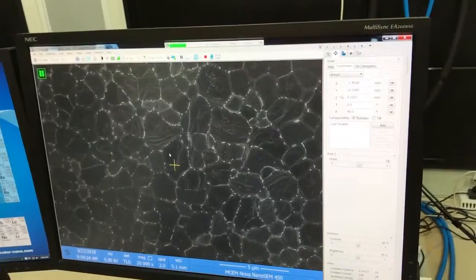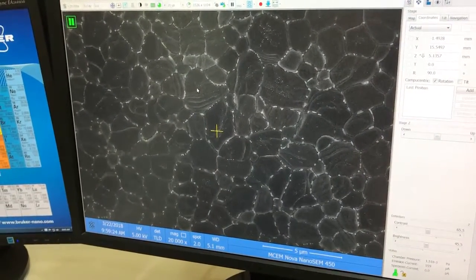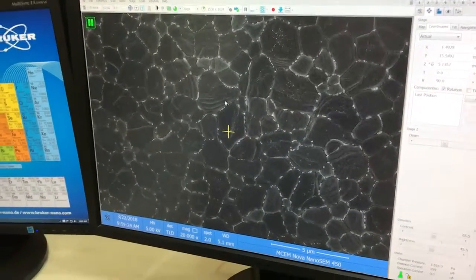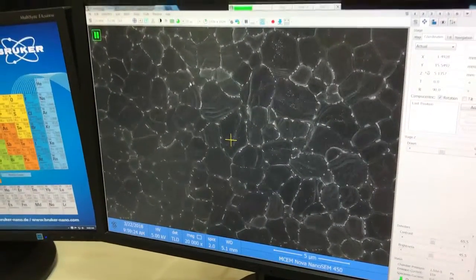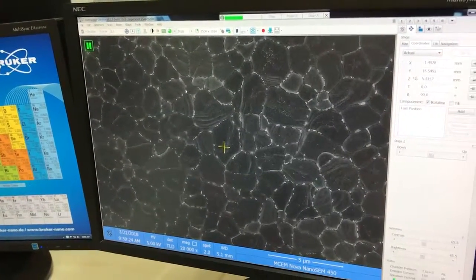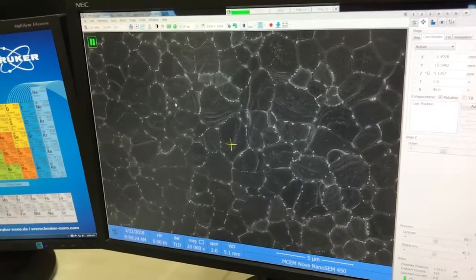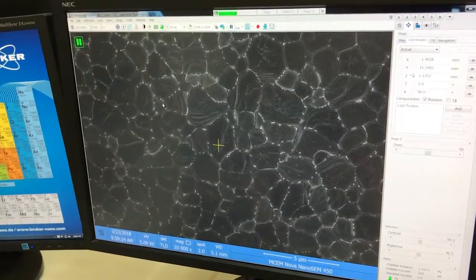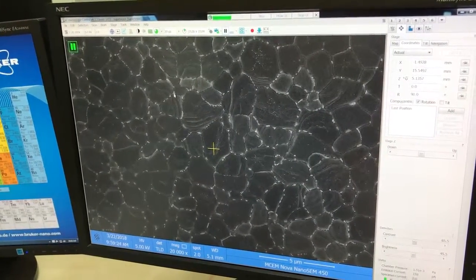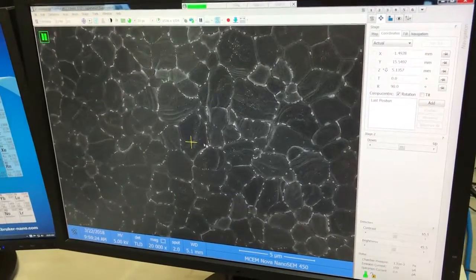Okay, the perovskite material for this sample is methyl ammonium lead iodide. Methyl ammonium lead iodide, excellent. These small features can potentially be degradation of the film. It happens when we apply too much heat to the samples. So this could potentially be the lead iodide, right? Yeah, with the methyl ammonium stripped off it.